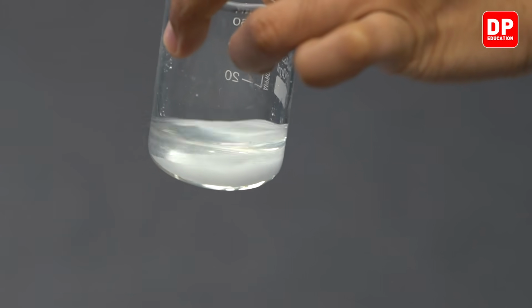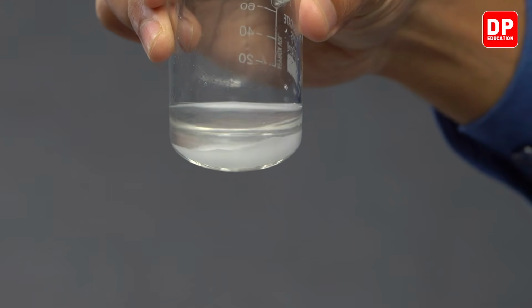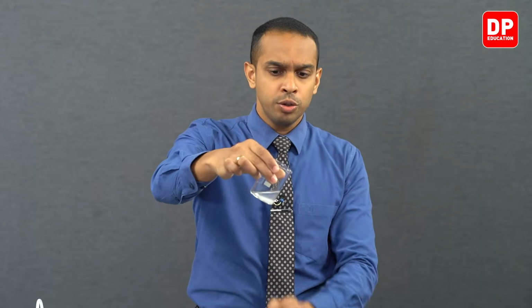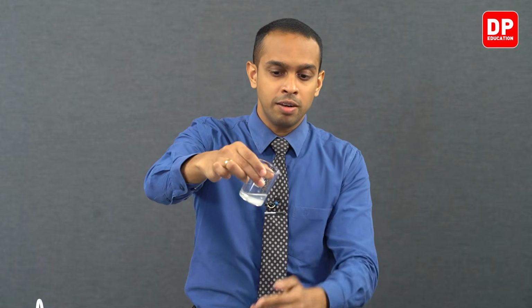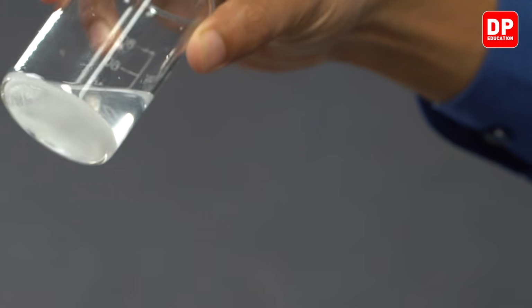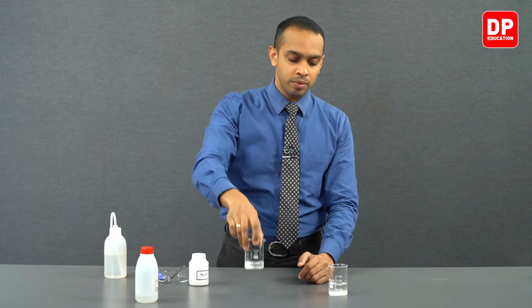There are no clumps observed when you mix sodium sulfate in the methanol that we have here. It falls like powder inside the methanol without forming any clumps.